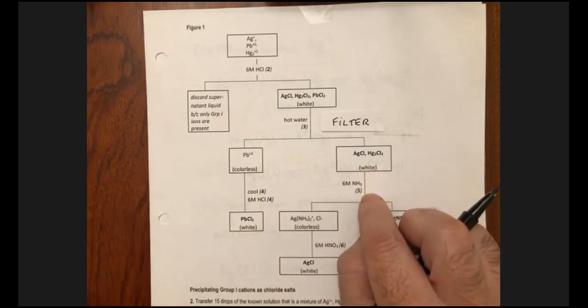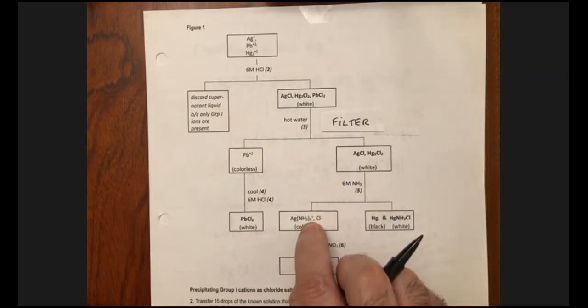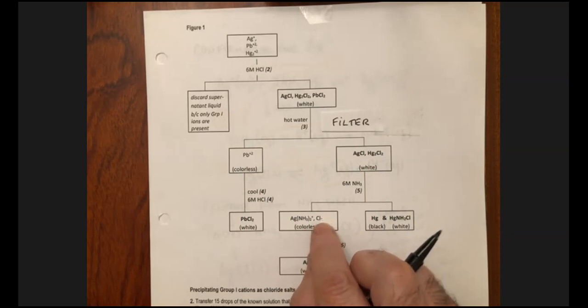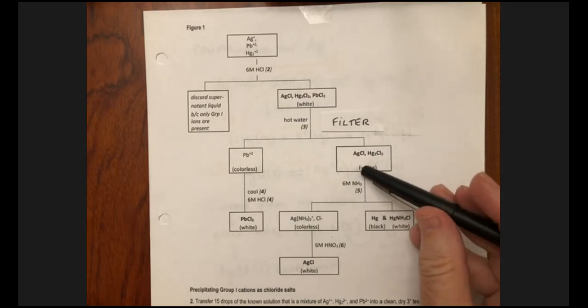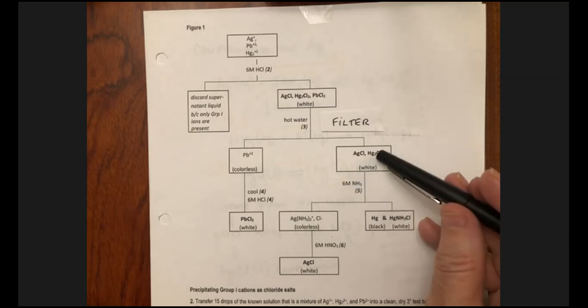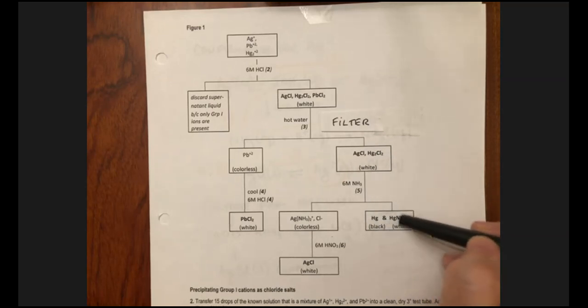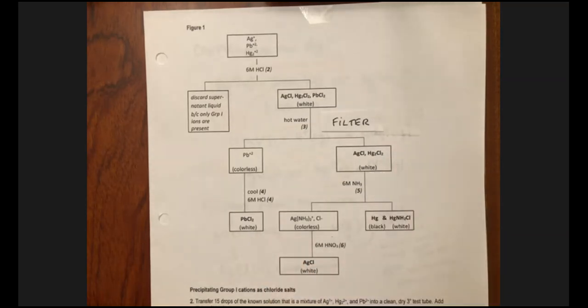Here we're going to wash the filter with ammonia. And again, in the filtrate, we should be getting the complex ion of silver now, which keeps it in solution. But then when we add acid to that mixture and we remove the ammonia, the silver and the chloride ions rejoin and form this precipitate. At the same time, when we add the ammonia, it was a kind of a double whammy here, because the ammonia would have reduced the mercury ions into mercury, and that'll give us a solid precipitate, right? So this is a very useful type of approach.